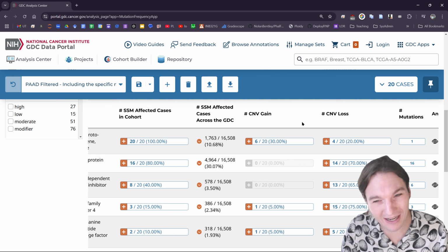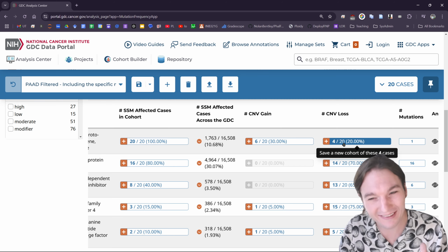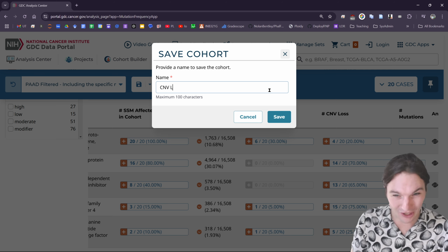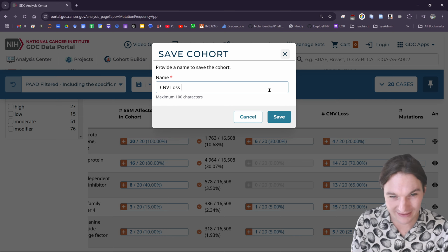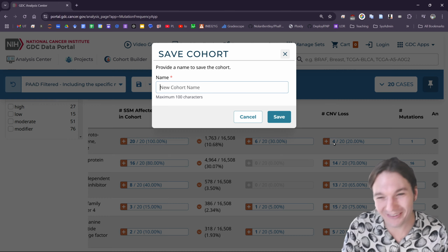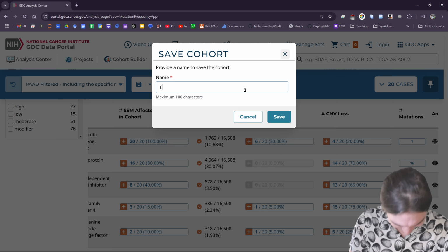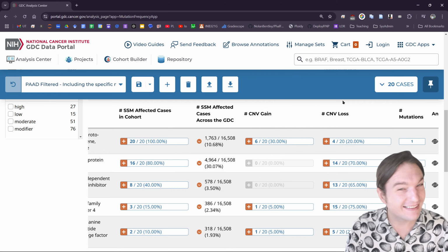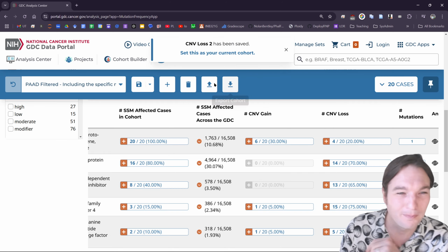Okay, it worked. Now, once that starts happening, it does tend to last for a bit, so bear with me. CNV loss 2. Dang it! That was so close. I'm sorry for shouting. Come on. Yes, got it. Cool. All right.